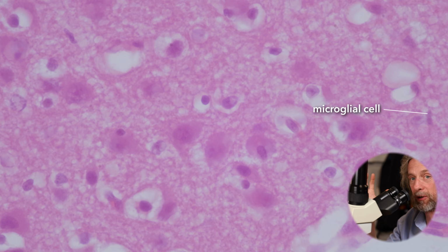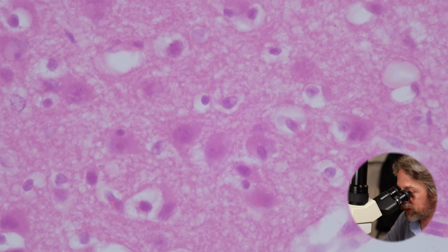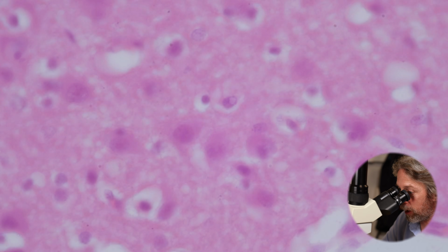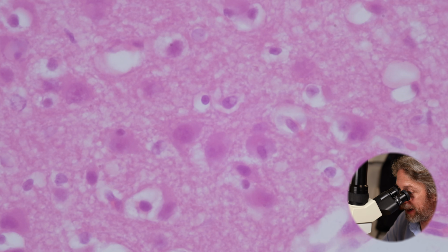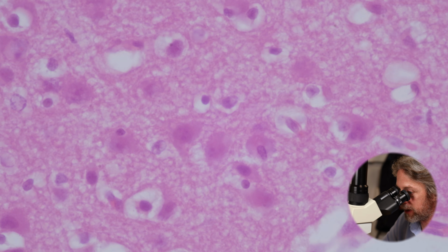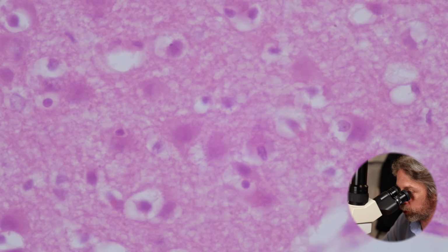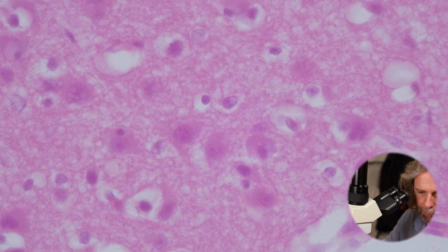And the microglial cells are like the phagocytes of the central nervous system. So if phagocytes elsewhere in the body are the big eaters, they go and munch up stuff that shouldn't be there and take it away. That's a big role for the microglial cells. They eat up things that shouldn't be here and get rid of it. And that means that they do actually change their shape when they're in different modes and doing different jobs and what have you. I can see, of course, I'm talking about these very happily in my field of view, but can you see them? There we go.